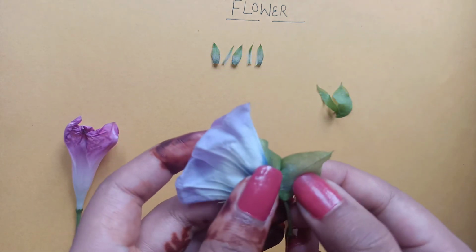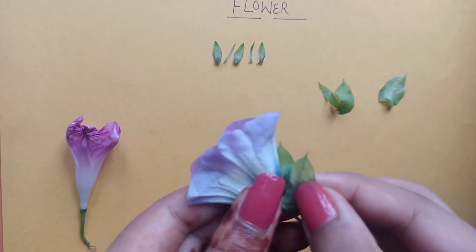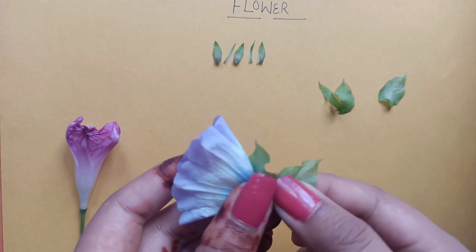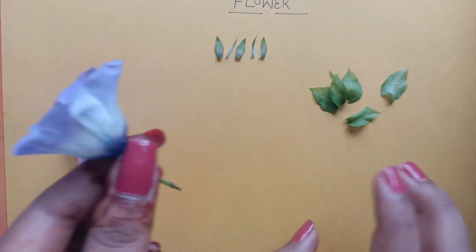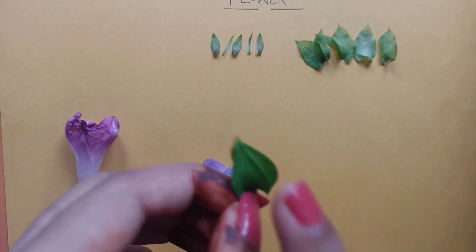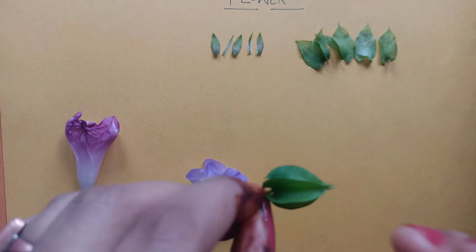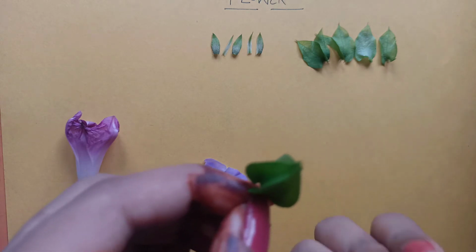Then we have this, which is second, and this is third. So 5 sepals. Usually there are 5 sepals. So what is the function of the sepals? The function of these sepals is that they enclose the inner whorls of the flower.